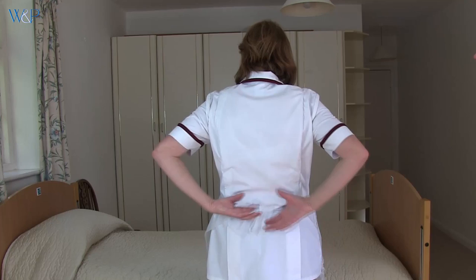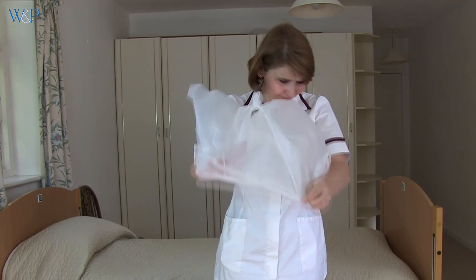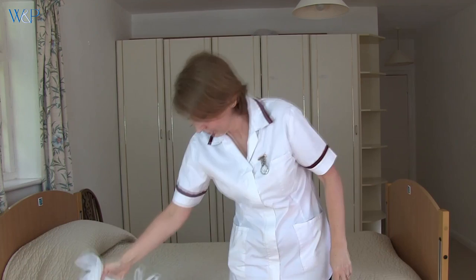Ensure safe disposal in the appropriate bin. You should always assume your apron is contaminated and remove it safely by unfastening or breaking ties, touching only the inside of the apron, pulling your apron away from neck and shoulders and lifting over your head. Fold or roll the apron into a bundle and ensure safe disposal in the appropriate bin.